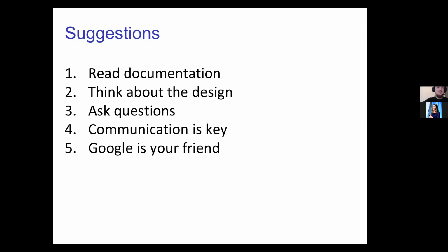The second thing is to think about the design. Here I'm talking about the design of the experiment. How are the samples prepared? In what batches were they prepared? How were they sequenced? Which chips were used? How were the sample variables distributed across experimental batches?